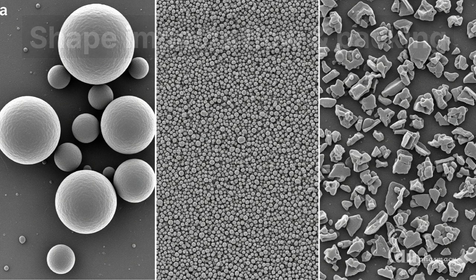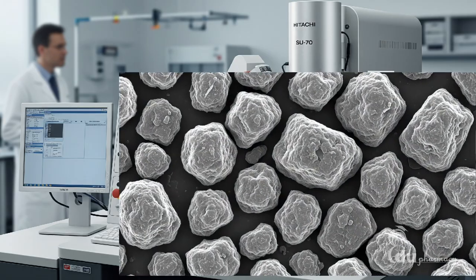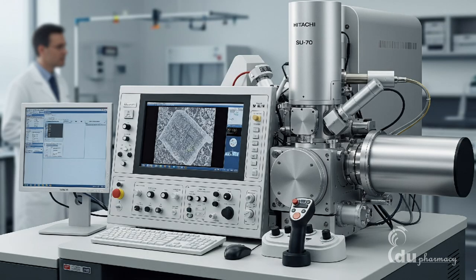To study this, scientists use scanning electron microscopy, or SEM, which produces highly detailed images of particles and their surface features. This helps predict how the powder will behave during processing.